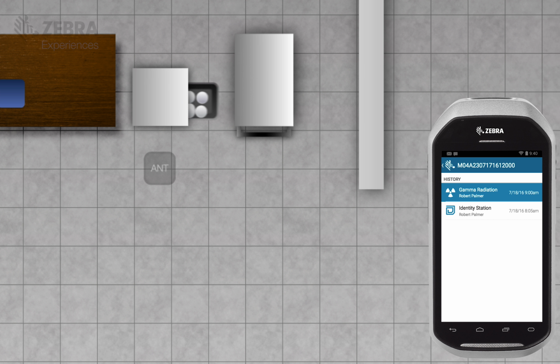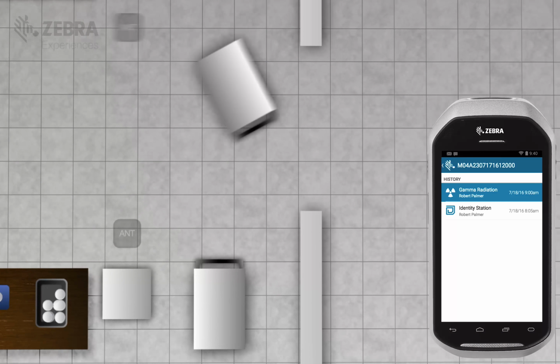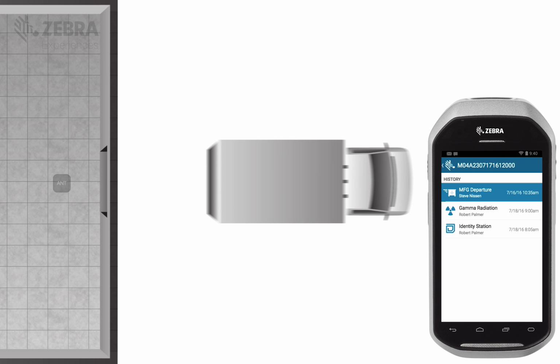Our cultures are now ready for transport to the EML. They are loaded onto a cart and placed on a truck. Again, an antenna records this activity and logs the cultures and operator as they pass through this area and gives them a departure time-date stamp.